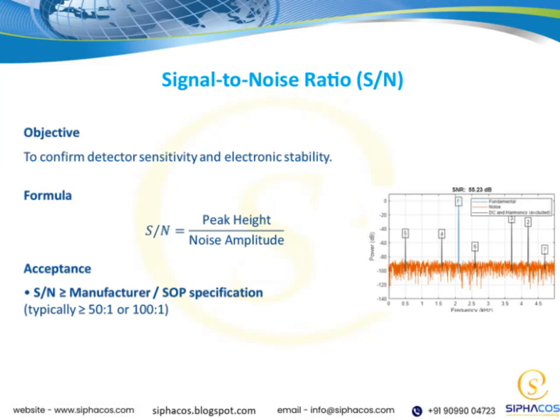Let's talk about the signal-to-noise ratio, or SN for short. This is a really important concept because it helps us understand how well a signal can be distinguished from background noise. Essentially, a higher SN ratio means that the signal stands out clearly against the noise, making it easier to analyze or interpret. Conversely, if the SN ratio is low, the noise can obscure the signal, which can lead to errors or misinterpretations. In many fields, whether we're dealing with communications, data analysis, or even imaging, optimizing the SN ratio is crucial for accuracy and reliability.